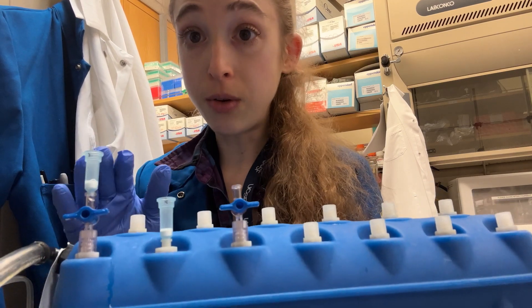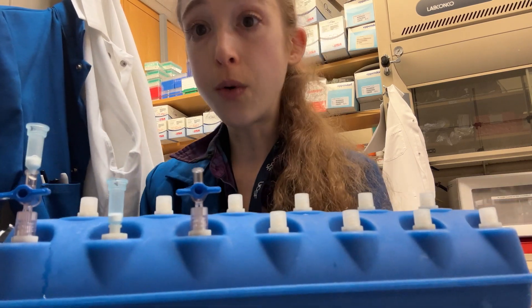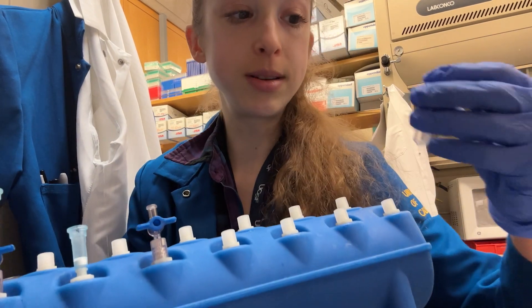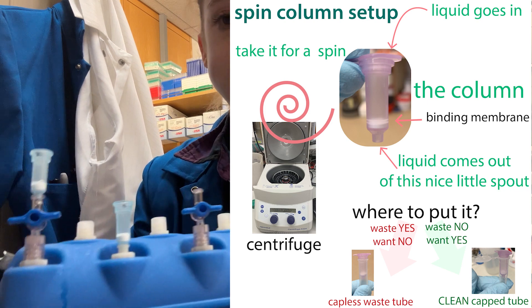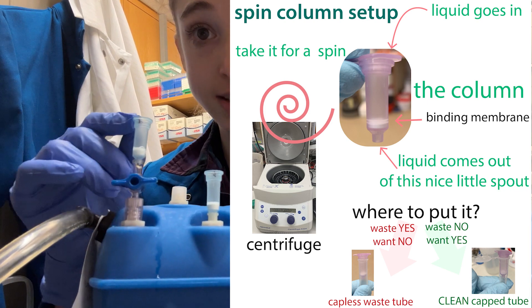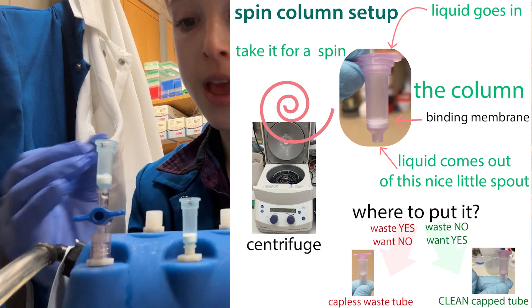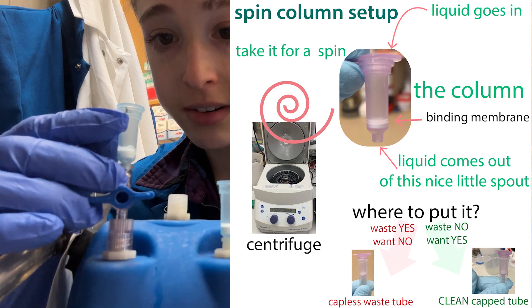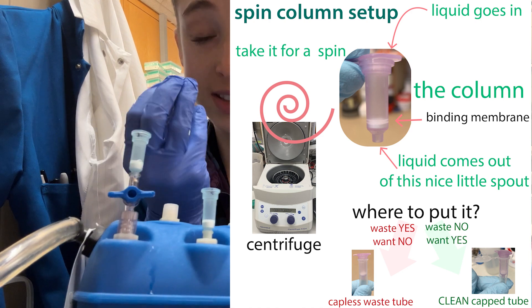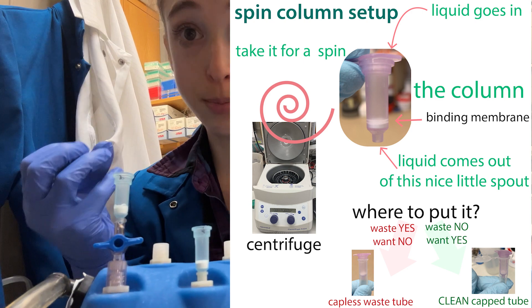One thing to be careful with when using a vacuum manifold is that you don't have a labeled tube bottom to keep track of samples — you're going straight into the manifold. So you need to make sure that you're labeling the columns themselves, not just the tube you're going to put them into. I recommend labeling at the very top ledge, so you can still see the label when you put it into the waste collection tube and then into your sample collection tube.